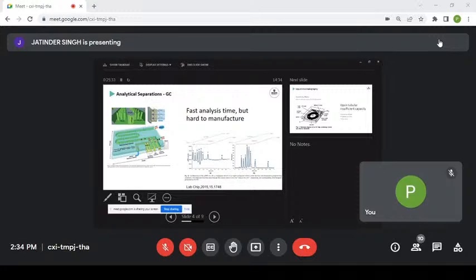And here you can see a comparison of the chromatograms, so the electronic trace that you get out of the detector when you send that mixture through a microfabricated column. And here on the right-hand side, it's the left-hand side for you, right-hand side for you watching, you can see how the same trace looks in an expensive cubic meter benchtop instrument. You can see the order is the same, peaks are the same.